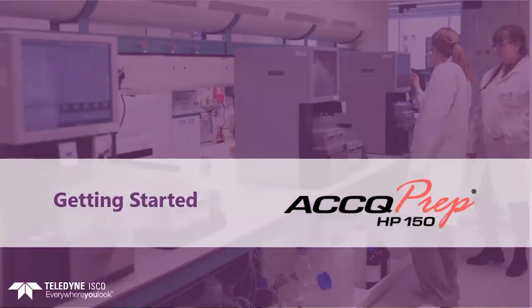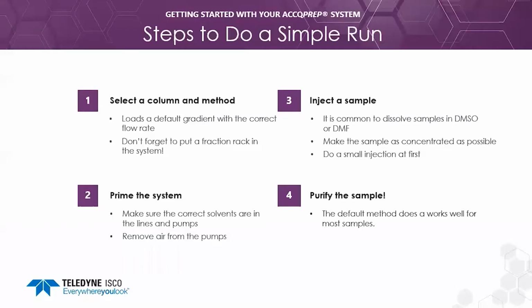We will begin with doing a basic run on the ACCQPrep. There are four main steps. Load the column and racks in step 1. Set up the solvents in step 2. I do the priming after setting up the column because choosing a method also loads default solvents into the method. Verify the solvents are the ones that you need for your sample, and if needed, change to the correct solvents for your sample. Step 3 is where column equilibrium and sample loading happens, and step 4 is where the sample gets purified.